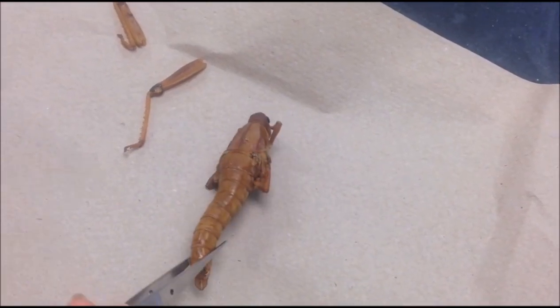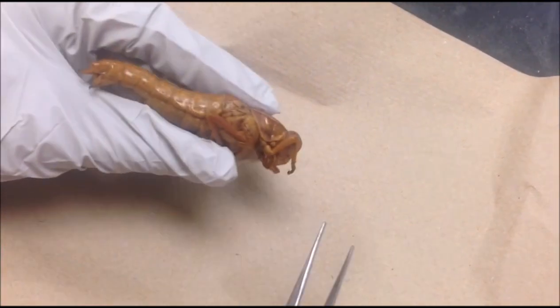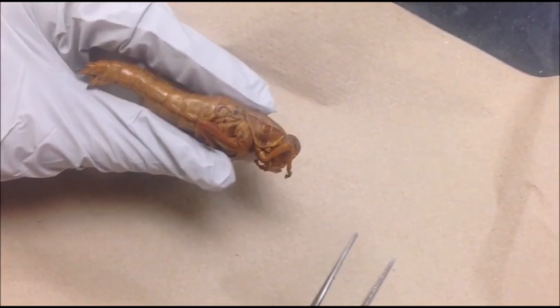Looking at the tail end of a grasshopper, you can assess whether it is a male or a female. If an ovipositor is present, as is in our grasshopper, then you will know that it is a female. The ovipositor is where grasshoppers lay their eggs through.